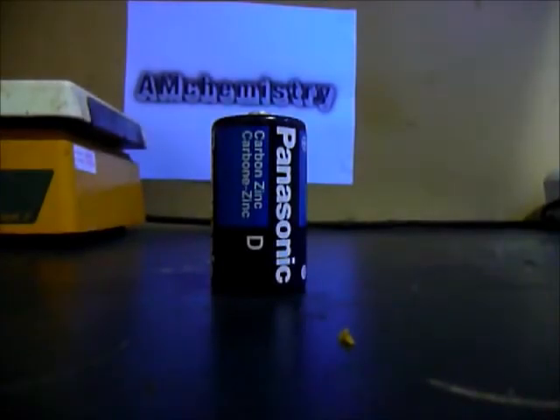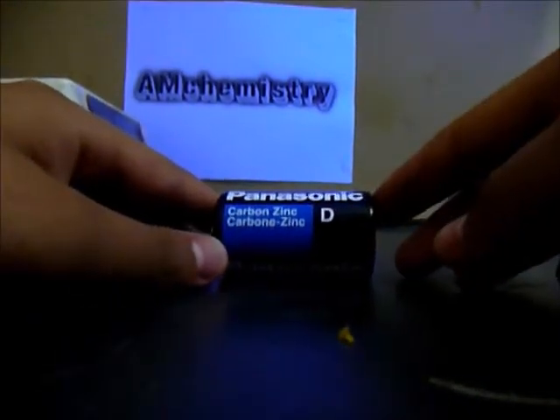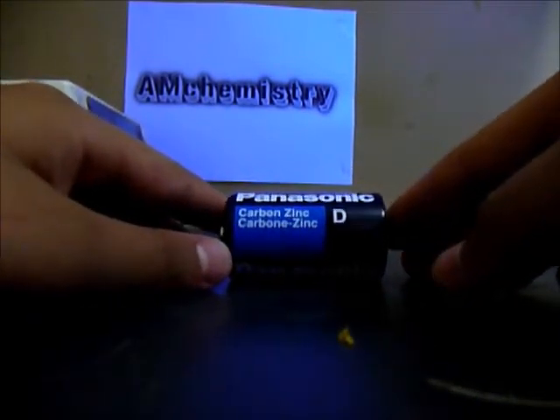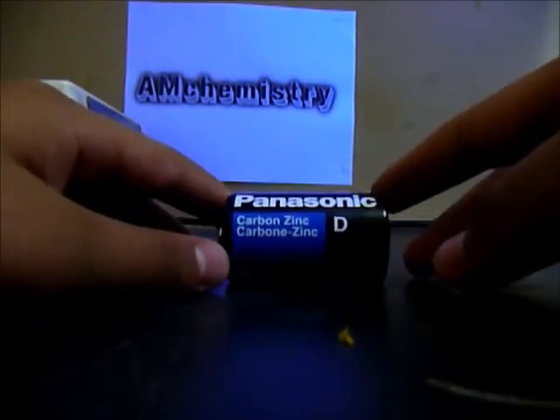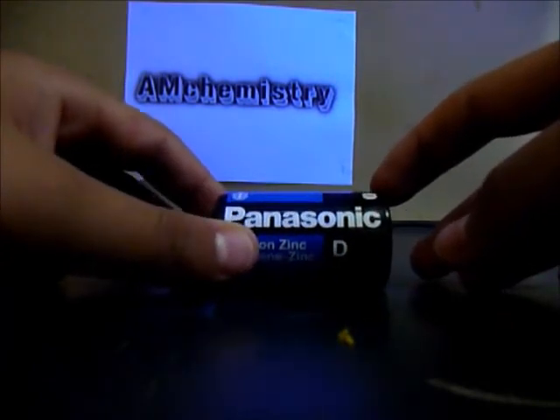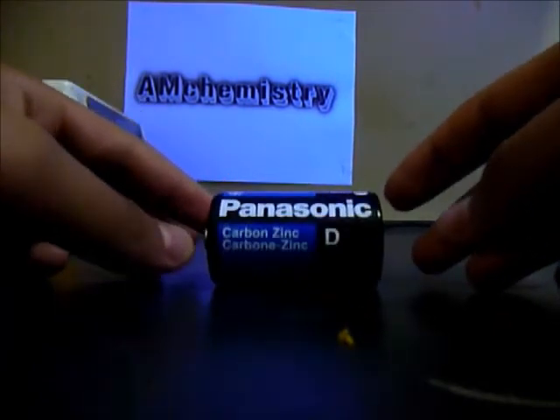Hi guys, today I'll be doing the extraction of carbon electrode, zinc metal, and manganese dioxide. And this is the battery I'm using to extract it.